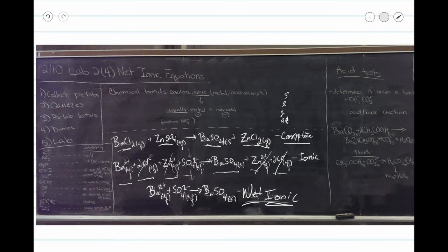Speaking of acids, we're going to do acid tests. We can establish the solubility of some precipitates using acetic acid. We're going to determine if the anion is basic.